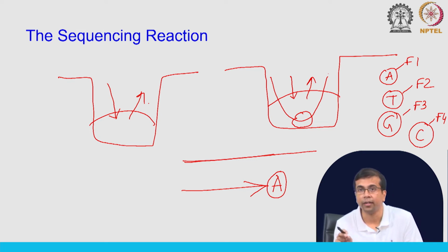So, you can now see why this is called single molecule sequencing: the signal comes from synthesis of the complementary strand of a single DNA molecule that is coming here and binding to the polymerase, where the synthesis is happening. And in addition, we can detect these signals in real time because the synthesis is happening at the single molecule level and we are observing those individual base addition events.